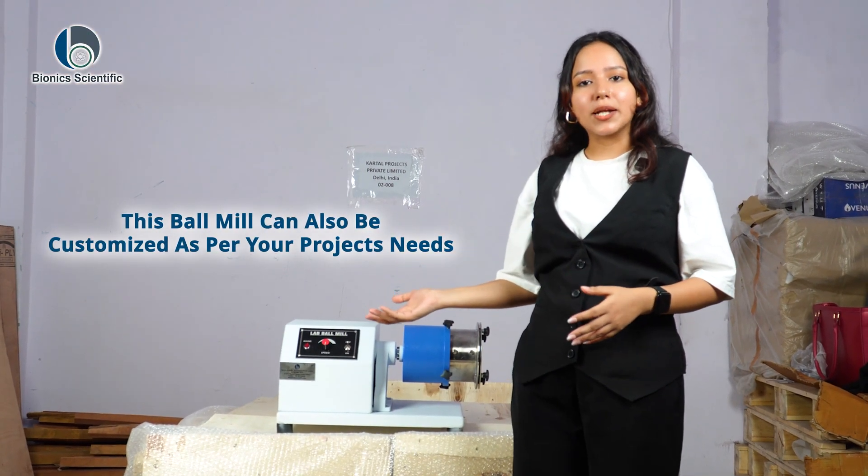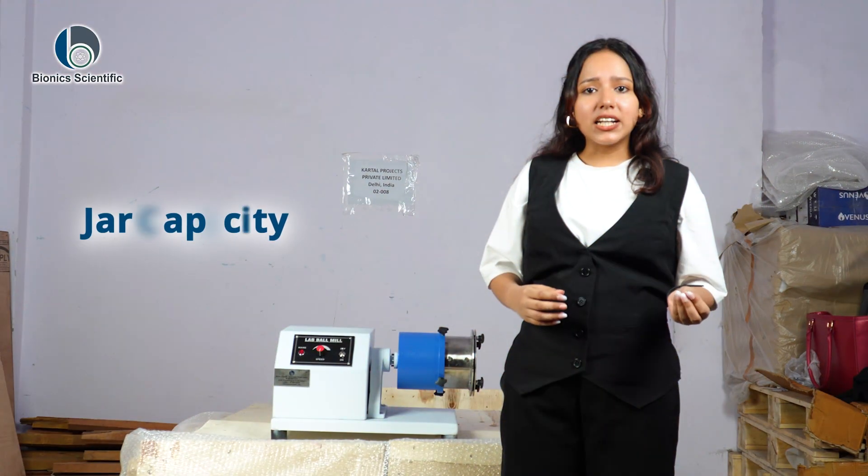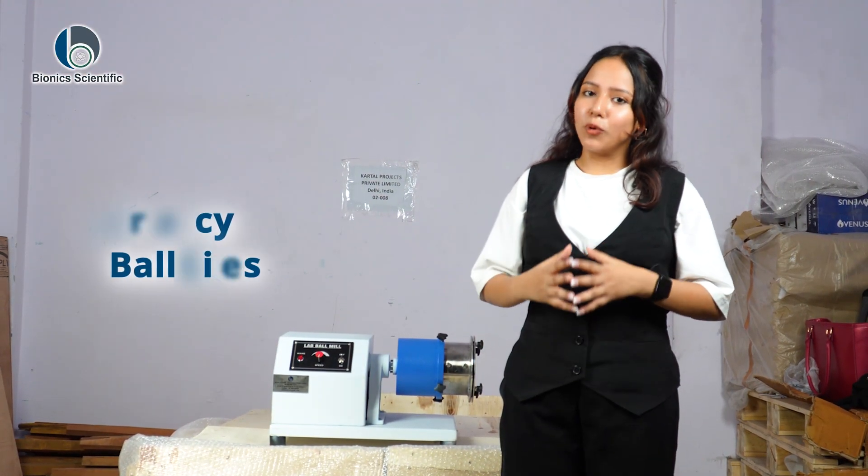Like all our lab equipment, this ball mill can also be customized as per your project needs — from jar capacity to ball size and more. We build it to match your workflow.